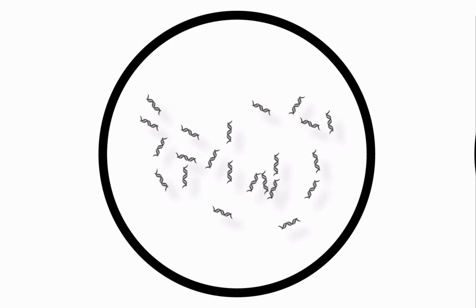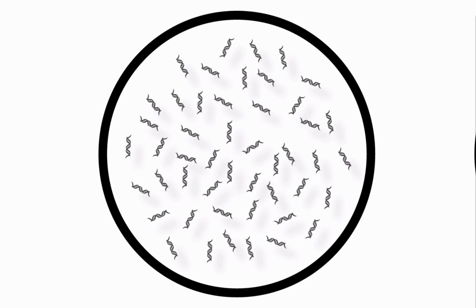But unlike RNA, cDNA is much more stable to work with and you can amplify it by PCR. The amplification makes it much easier to sequence the transcripts. So now each well on the plate contains the amplified transcriptome of one single tumor cell.